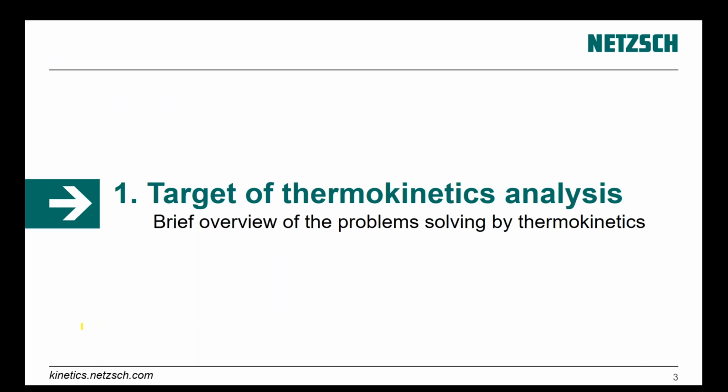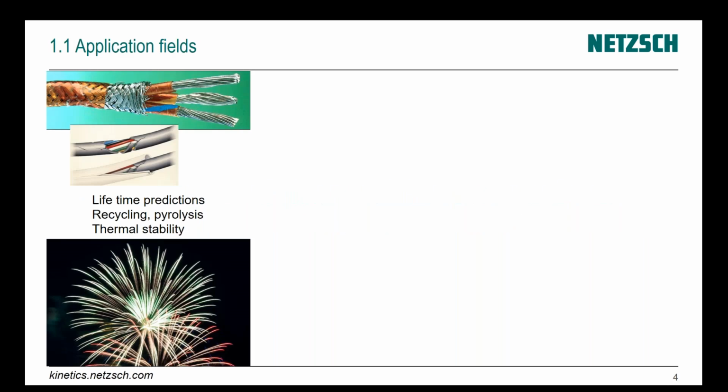And now, why do we need it? What kind of problems could be solved by this software or by these methods? Firstly, if you speak about electrical insulation, then this electrical insulation has some lifetime. If it works for some years, maybe then it will be degraded and will not be elastic anymore. And if it is broken, you can imagine what happens if electrical insulation is broken. Then it could be very, very dangerous. And the question is, what is the lifetime for electrical insulation or coating at different temperatures, maybe at enhanced temperature inside engines? We should know this.